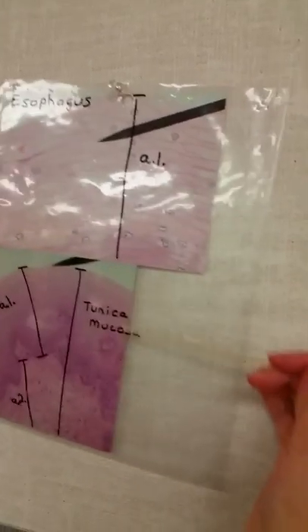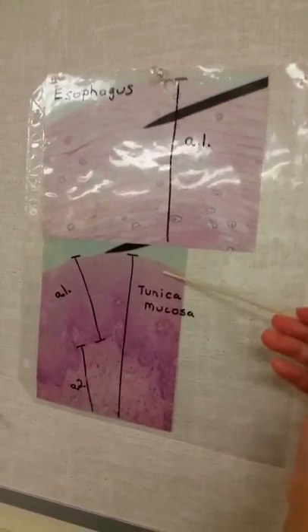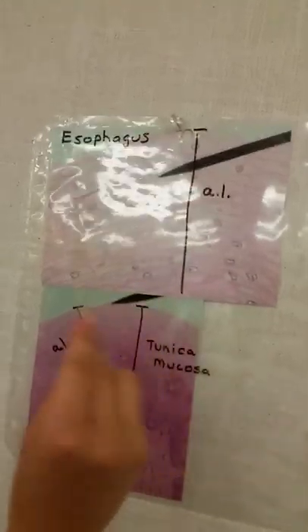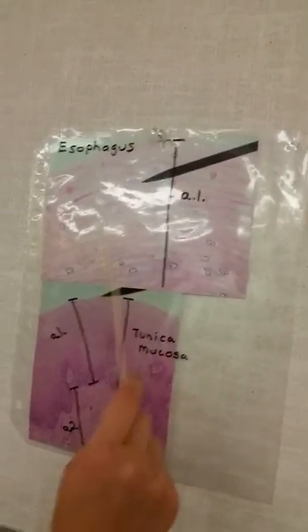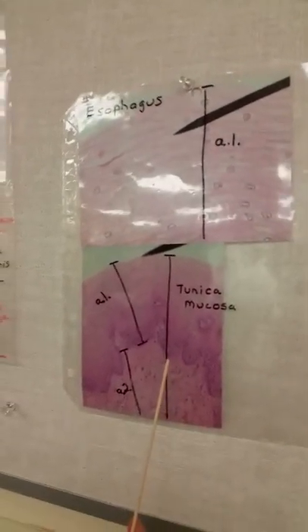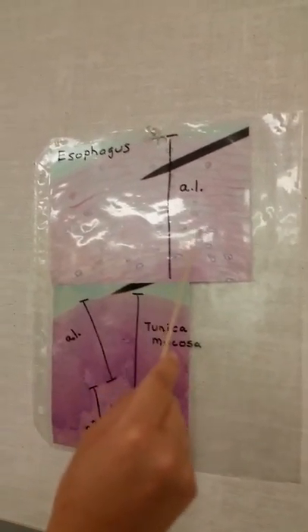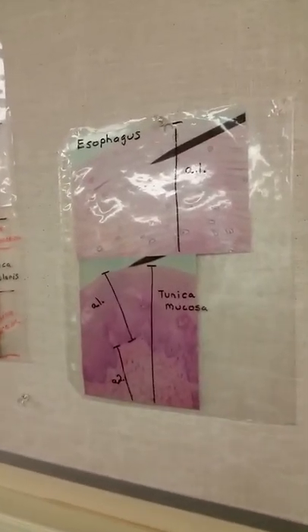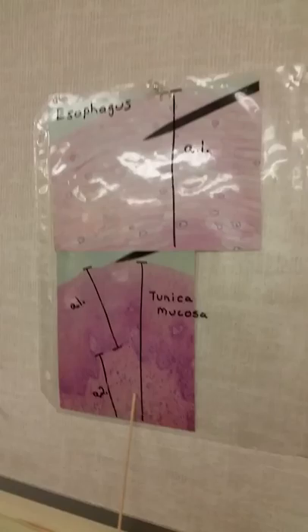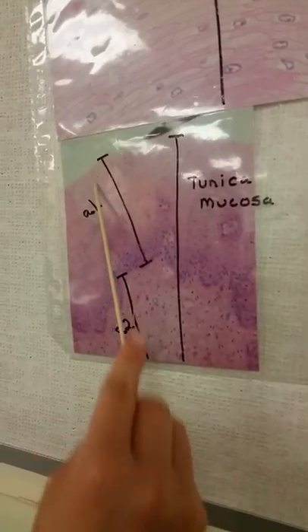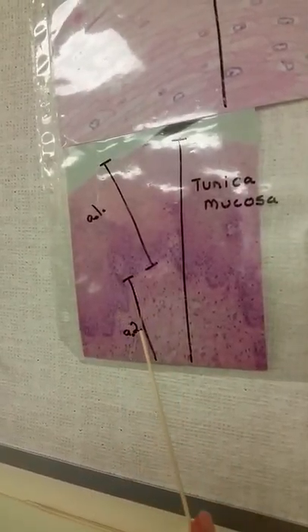Moving on to the esophagus. This is the tunica mucosa. And this is a stratified squamous epithelial tissue, non-keratinized, which is that. And then the connective tissue would be between here, between the cells. For a lower power, it would be right here for the stratified squamous epithelial tissue, right here all the way to here. And the connective tissue.